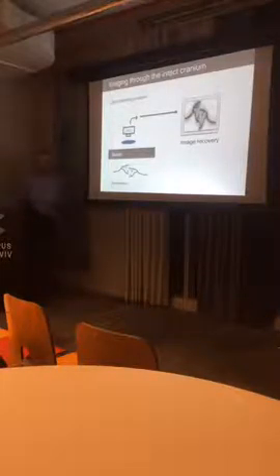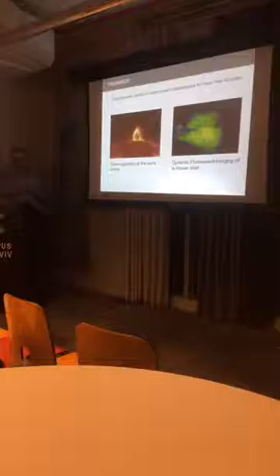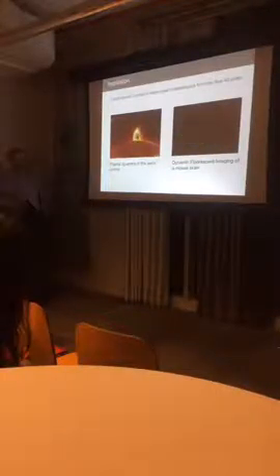And how can we do it? What can give us inspiration? We got this inspiration from astrophysics. I have a colleague that came from the Paris Observatory, and they have worked a long time, longer than biologists, on analyzing dynamic information. For example, plasma dynamics of the sun is similar to dynamic fluorescence in the mouse brain. And working together, we got very interesting results.